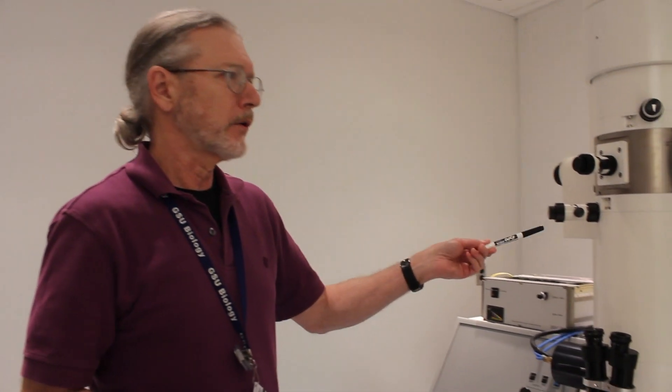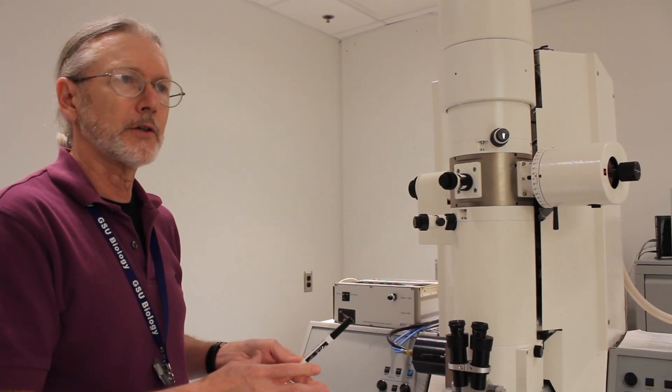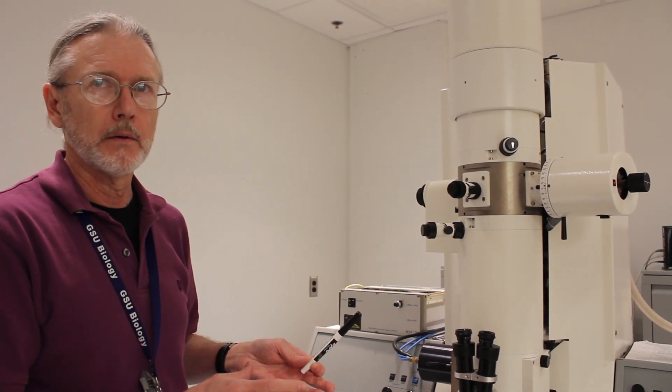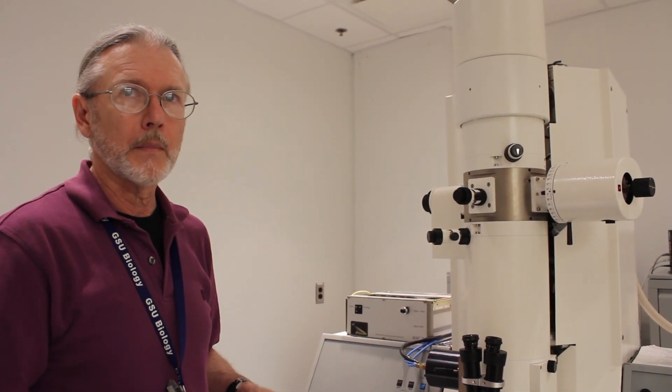Now with this microscope, we're going to embed in a hard plastic, and our sections are going to be about 70 nanometers thick. So they're much, much thinner.